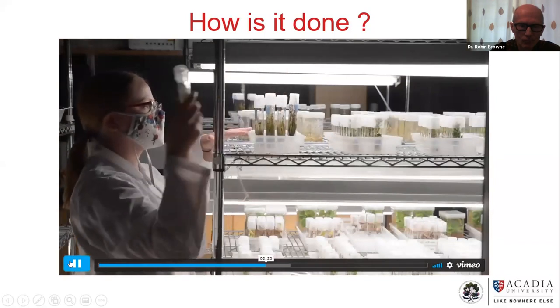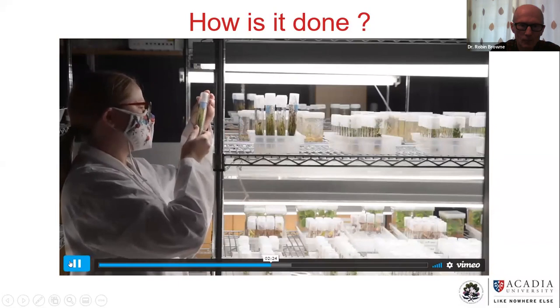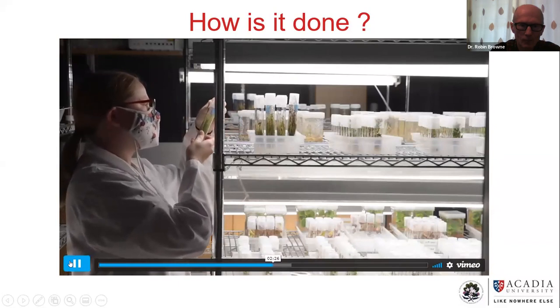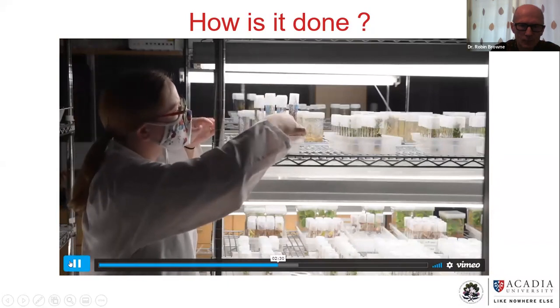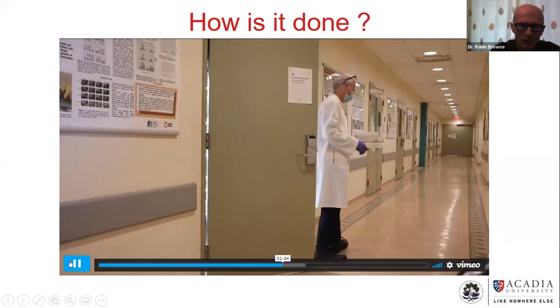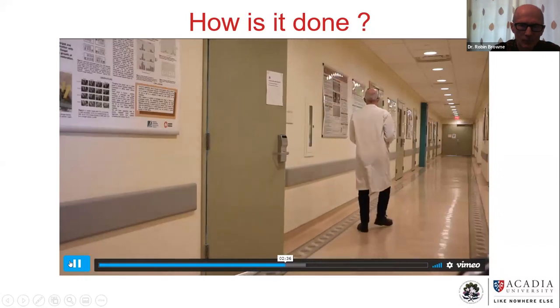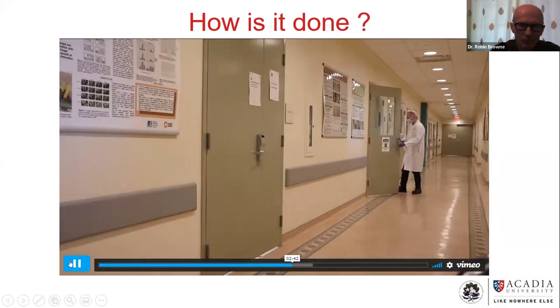Initiated cultures are checked regularly over a 2 to 6 week period for any signs of contamination or growth. Non-responsive or contaminated cultures are removed from the population, and the remaining material is transferred to fresh medium, usually of a different composition, to establish a stable starting population of clean growing cultures. This transition period is termed the stabilization stage.